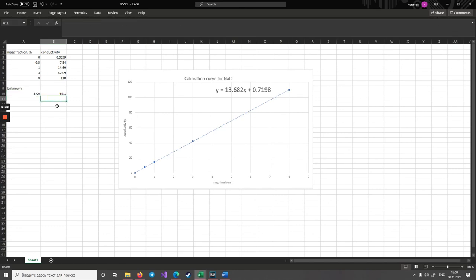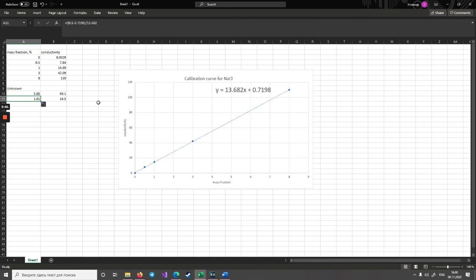For solution number two, the measured electric conductivity is 14.5. Applying the same formula, we get approximately one percent. We prepared a solution with concentration 0.9 percent, so there is a small discrepancy. This is acceptable, as mistakes can occur during dilution when measuring with the pipette, when adding water, or when measuring the electric conductivity. Generally it is very close to 0.9 percent.